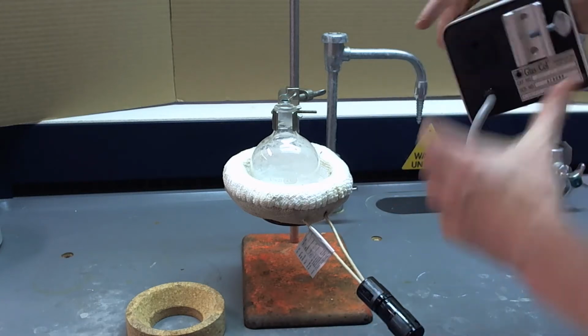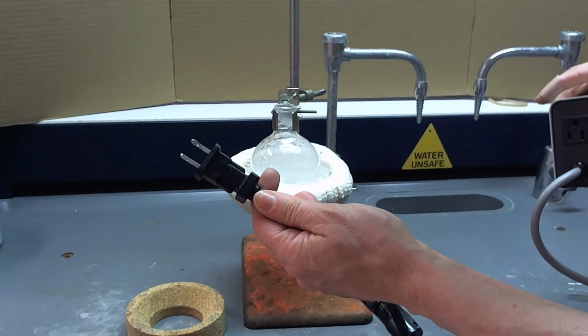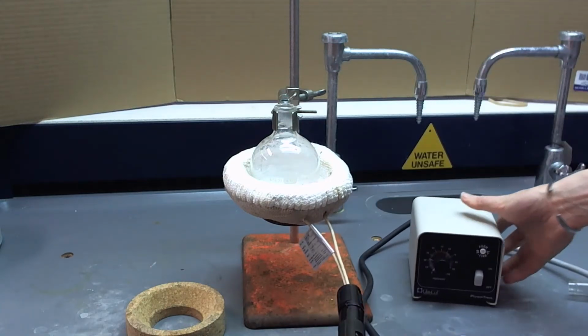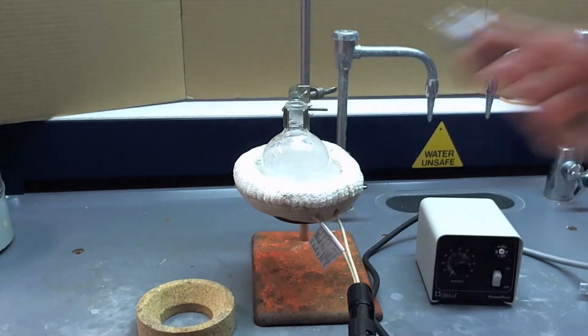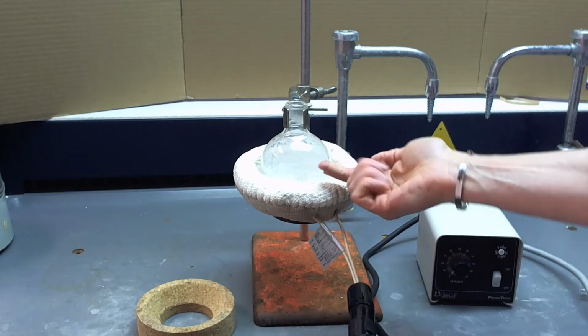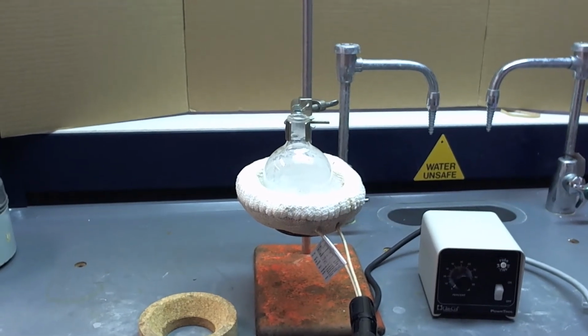If we turn it around, you can see there's an outlet. So I take my heating mantle cord and I plug that into the temperature controller. Just find a good spot for that. And then I can take the temperature controller cord and plug that into an outlet in the wall. Okay. All right, now that would just be heating. And if we boiled this flask, the vapor would escape. So next is the reflux part.